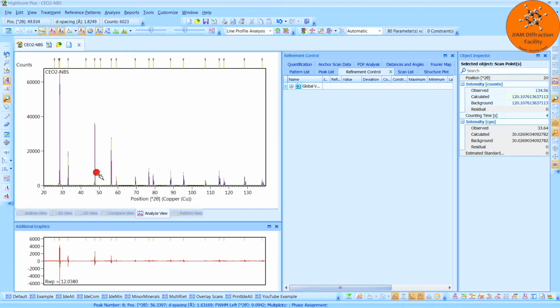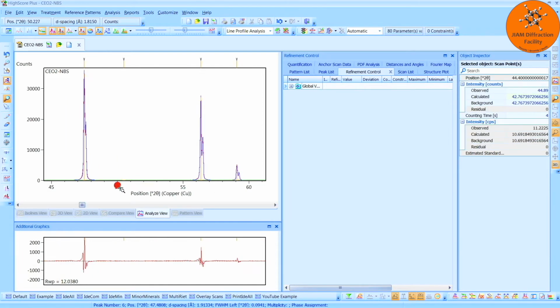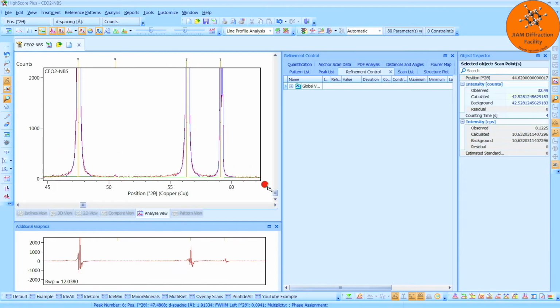Now, I do want to show you one thing that involves the low-intensity region around our peaks. I am going to try to zoom in on these 3 peaks just for an example. And you will notice that even though I draw my zoom box, it's not really zooming in. That's because this button is activated. If we were to click this button, we could then zoom in better. I'll go a little bit more. There we go.